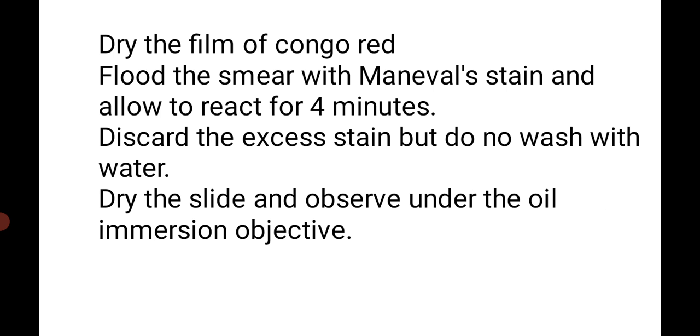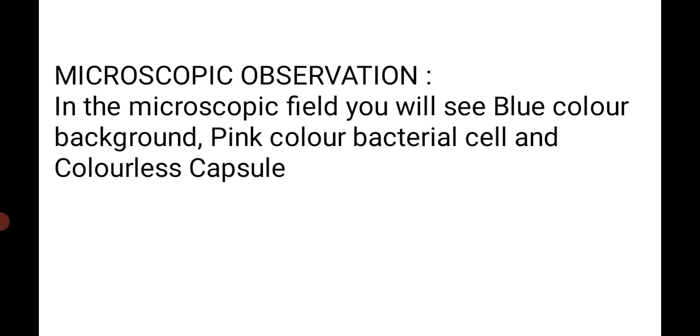Next point, flood the smear with Maneval's stain and wait for 4 minutes. Next point, discard the excess of stain by blotting paper, but do not wash with water. Then dry the slide and observe under oil immersion objective. Observe for blue colored background, pink colored bacterial cell, and colorless capsule.